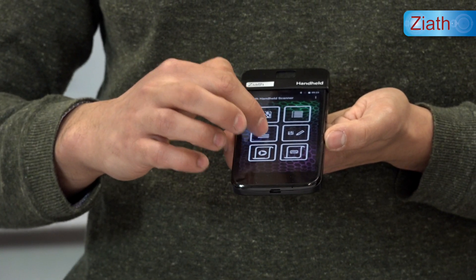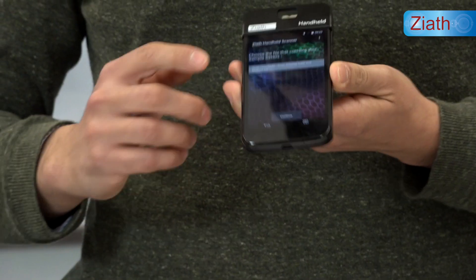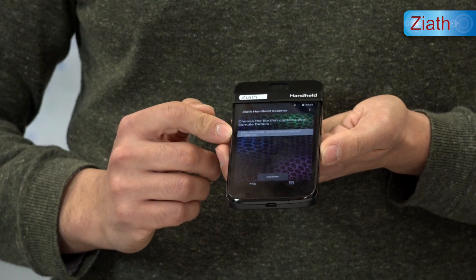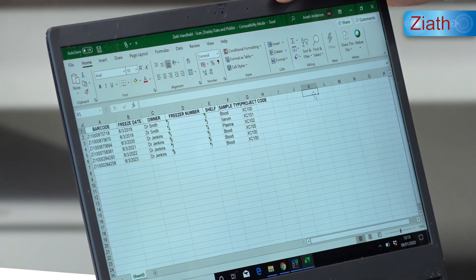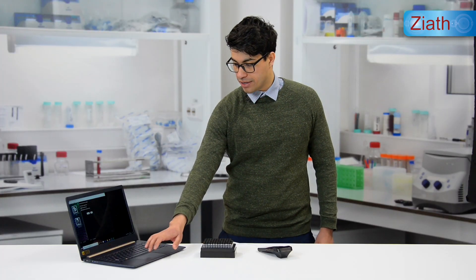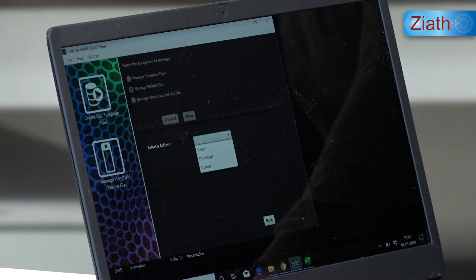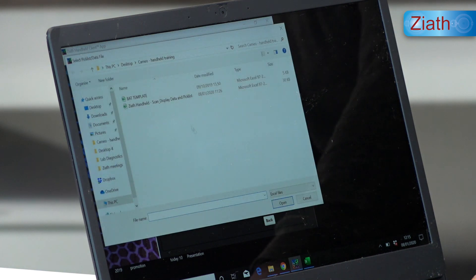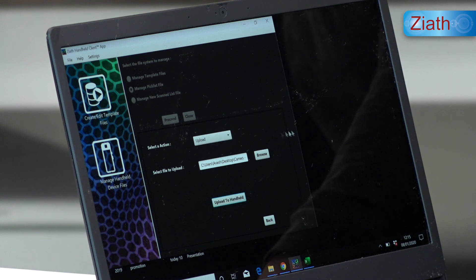For the sample lookup function, we can display sample information on screen that has been placed onto the handheld from the computer via an Excel file. With the handheld connected to the computer and the handheld client open, we go to manage handheld device files, manage pick list file, proceed. We then locate the file on the computer, open it, and upload to handheld. The file will now be placed onto the handheld and we can disconnect the micro USB cable and take it down to the freezer for scanning.